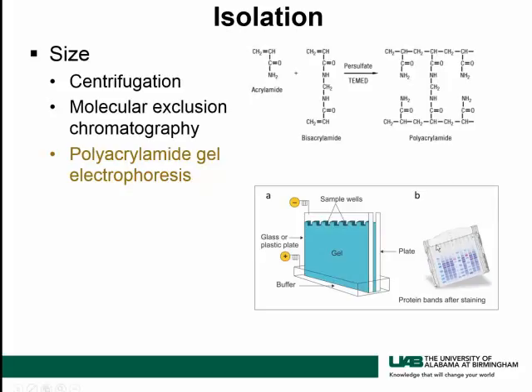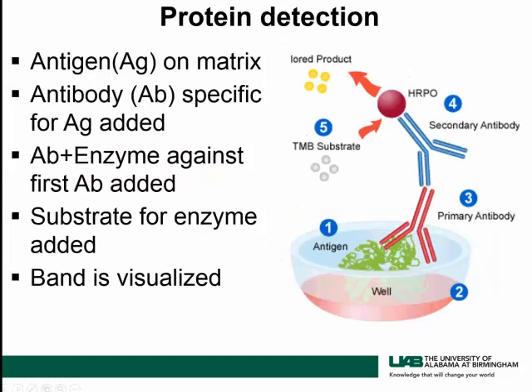And so when you run the gel, of course, they're going to move from negative to positive, and the smaller ones will move faster than the larger ones. Protein detection.